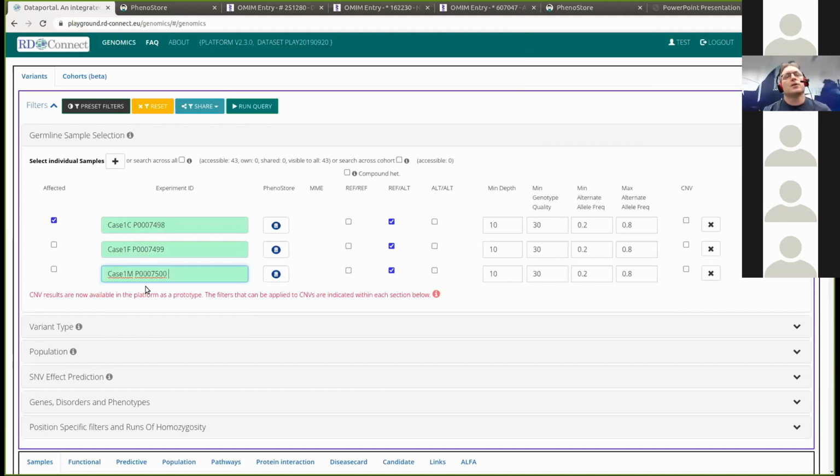Okay. First, let me explain a little bit more about what we've done here. We've taken publicly available genomic data from the Illumina Platinum Genome dataset, where they've sequenced the HapMap sample NA12878, performing whole genome sequencing to 50x coverage. She is the most sequenced individual in the world. And we also have her parents here, NA12889 and 90, I think they are, but it's in the information.